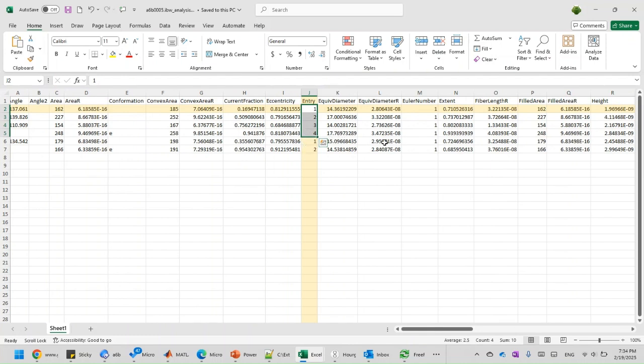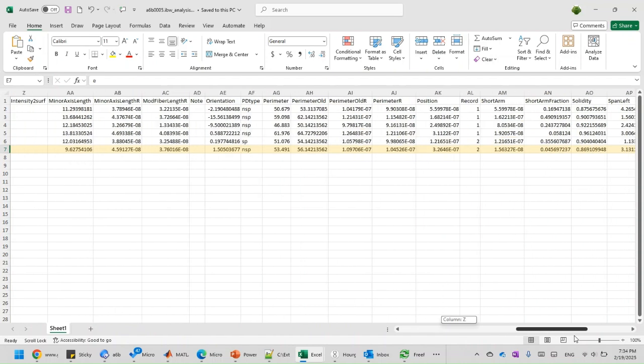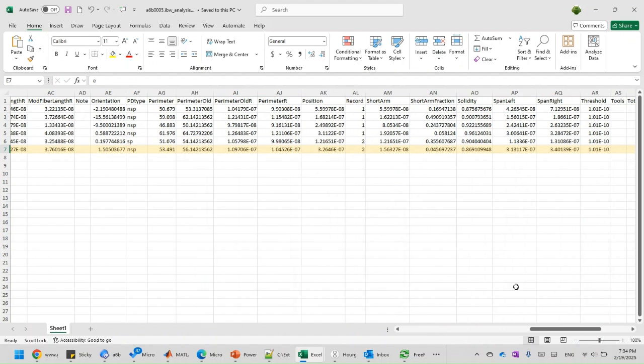And we have the second DNA, where there are two proteins, and we also have one end binding for each particle. So that's how the table is arranged in this Excel file. So right now this is our particle one, which has two records.